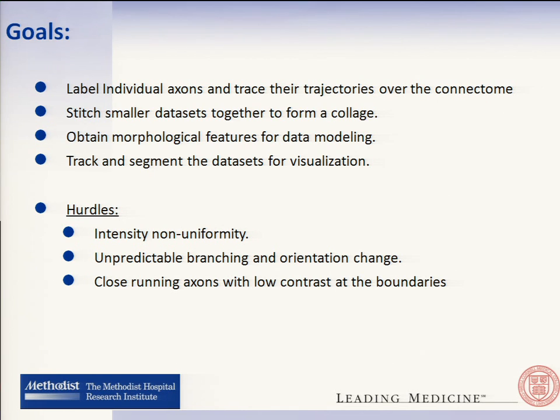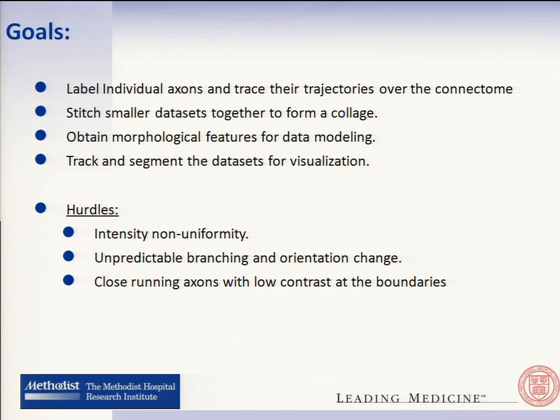The main hurdle we faced was intensity non-uniformity — the single most biggest hurdle. The axons would not express similar intensity; they would have drastic changes in intensity over very short lengths, which means we would see neurons appear and disappear randomly in the data set. There was also unpredictable branching and orientation change, and we had very close-running axons which looked like they were touching together, making it hard to manually differentiate between them.